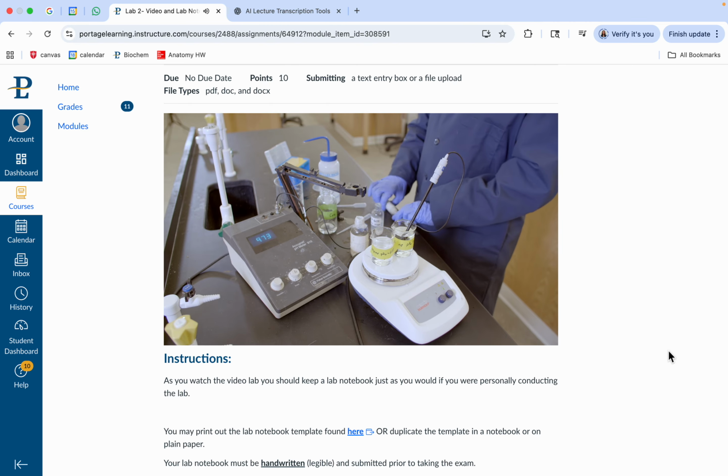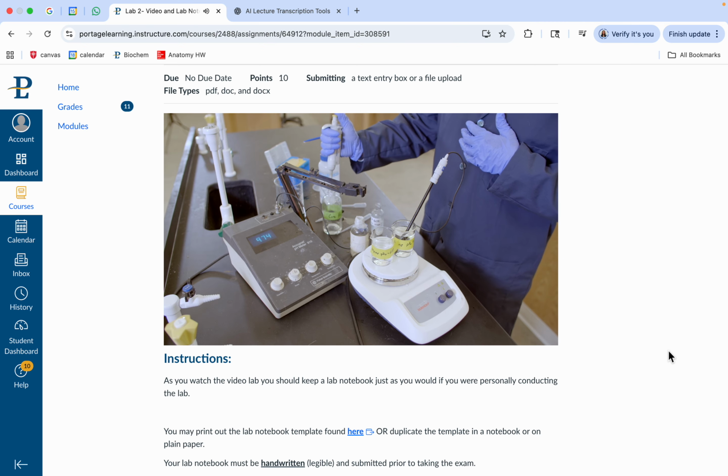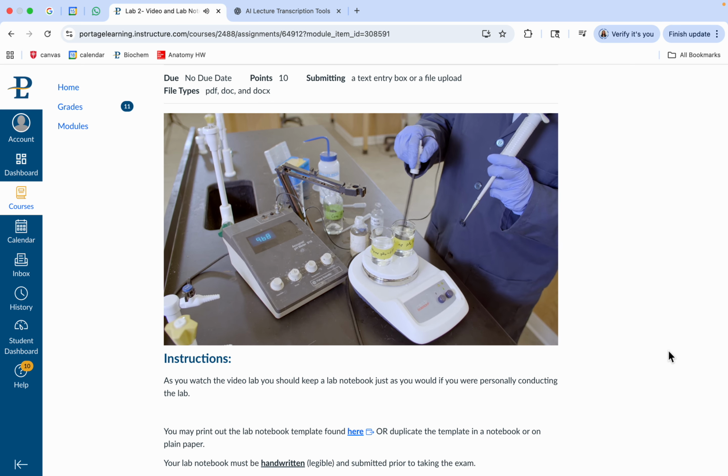and we got our solution at about 9.73. In this case, we'll add a little bit of acid, because we're going in the opposite direction, to see that acid additions can also be resisted. We put this in here and stir it around. Again, it does start to go down just briefly, as we would expect for an acid. Let's add a little bit more.